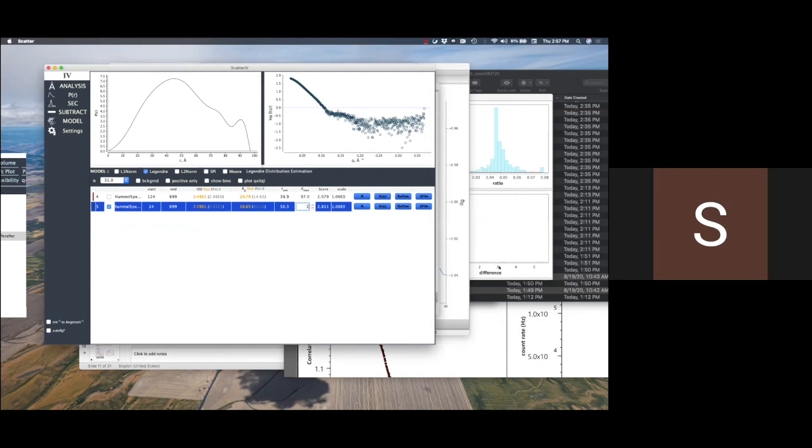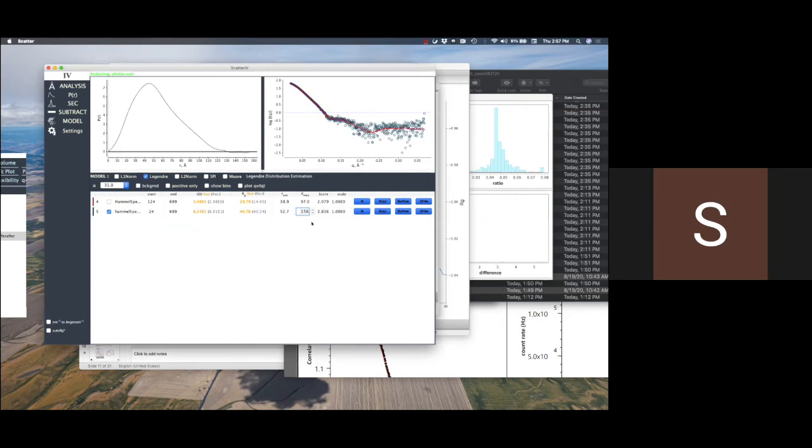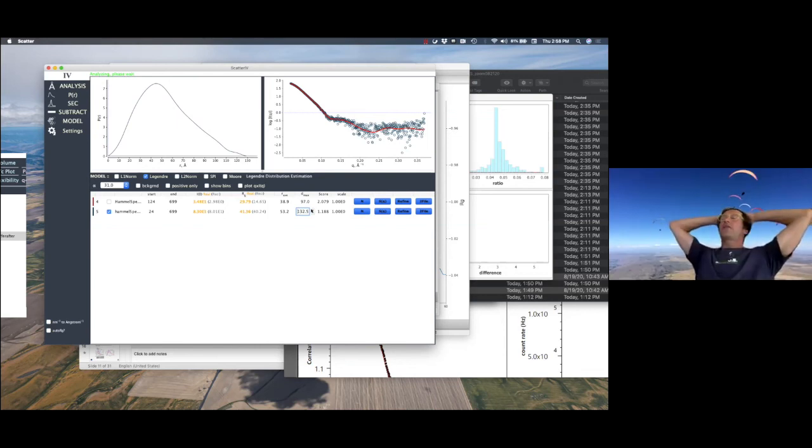So Michal, sorry, could I just ask for a clarification? Are you saying that I should create two curves, one where I subtract the buffer before and one where I subtract the buffer after, and where they differentiate is where I should be cutting off to? That's the safe way. I would say yes. This is when you have plenty of time.